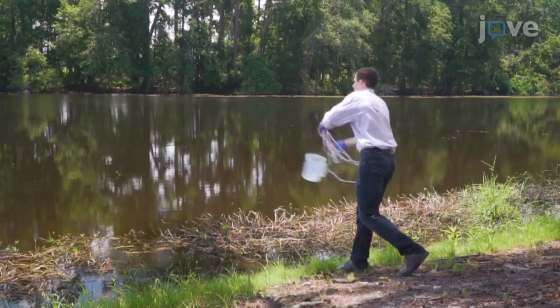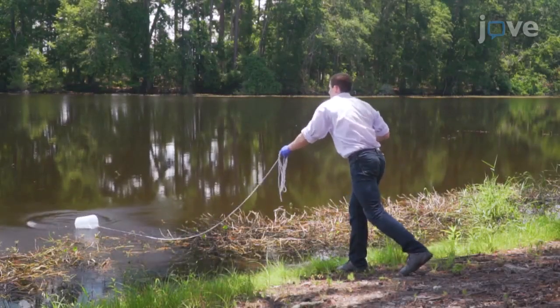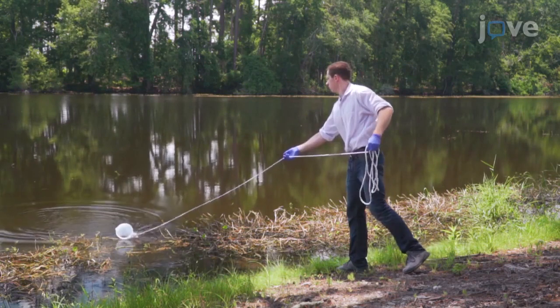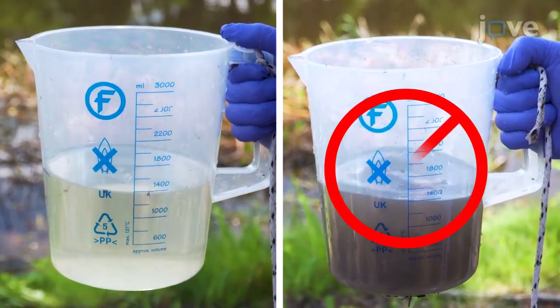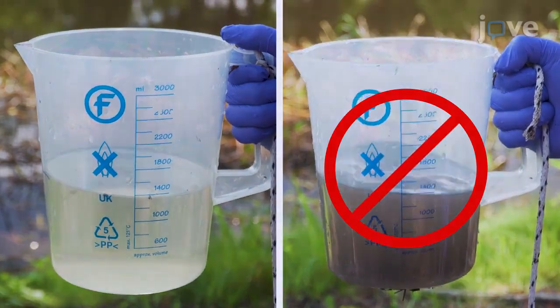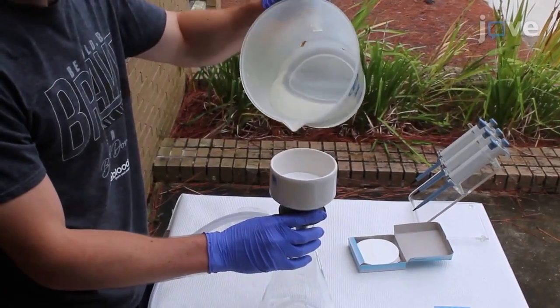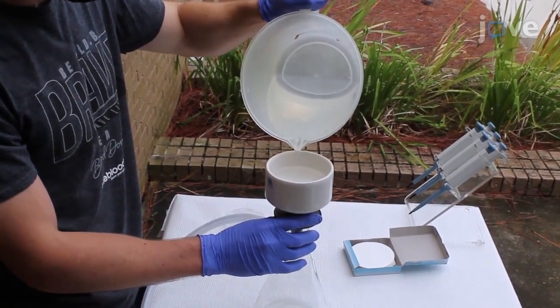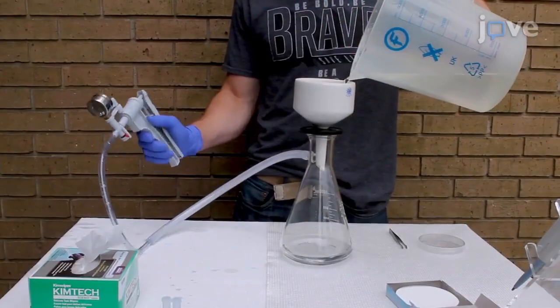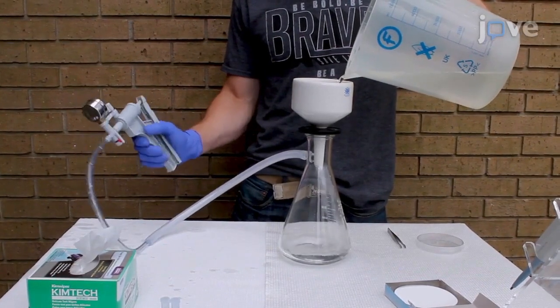To obtain water samples, collect irrigation water from the targeted source. The water may have small amounts of debris, but not significant sediment or soil. Slowly pour between 50 to 1000 milliliters of test water over the filter paper inside the funnel, while using the hand pump to create suction to pull the water through the funnel.